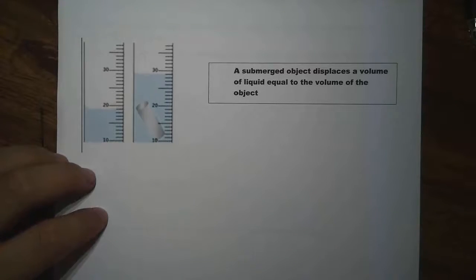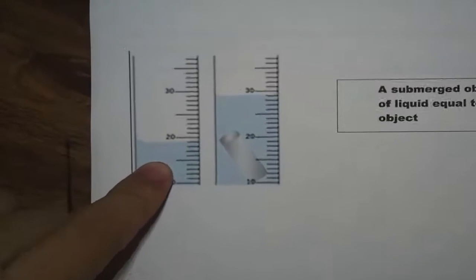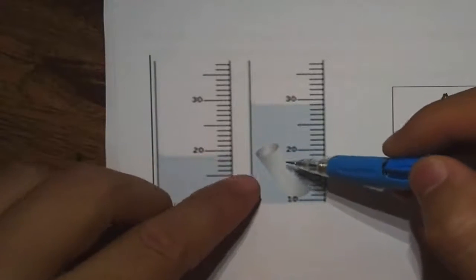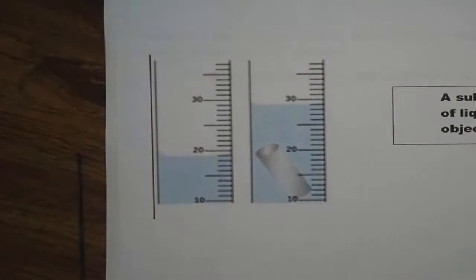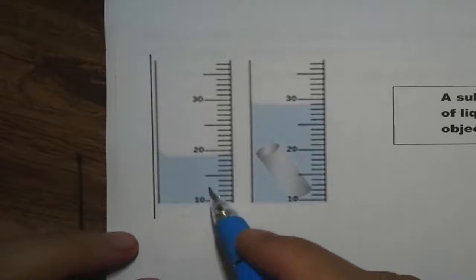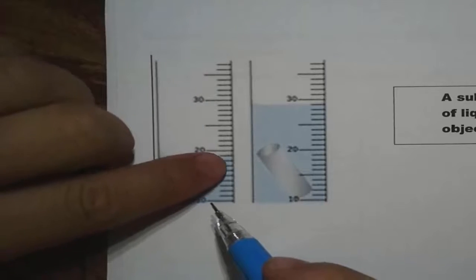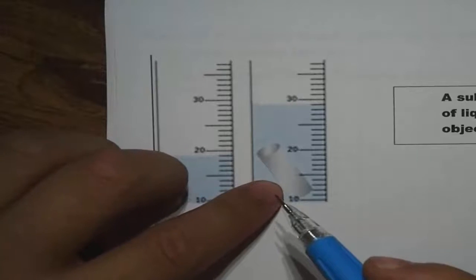How it works is basically you take the object and drop it in a graduated cylinder that contains water. Notice how there is a difference in the two readings, and that is because of the object here. This object is going to take over the space right here and push the water up. And that difference from here to there is the volume of the object.